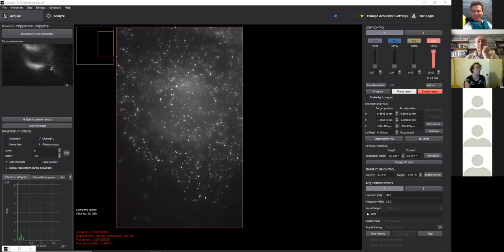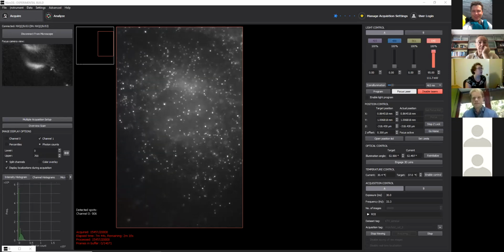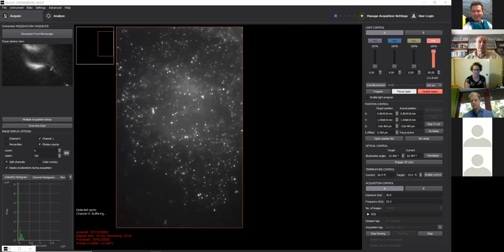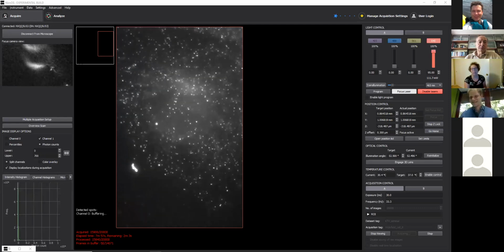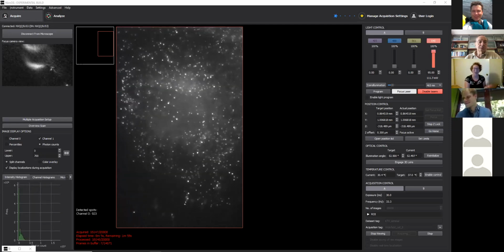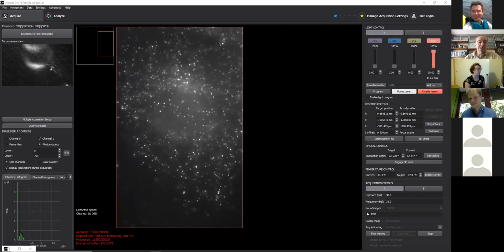Okay, cool. So basically, I'm gonna quickly run you through this and then tell you a little bit more about myself. So right now, what I've done is basically I've connected to a microscope in Oxford. It's actually, I think, next to Alex, or in the room next to him. I'm currently in San Diego, and so I'm operating this microscope remotely, which is pretty cool. Although it does require people in the lab in Oxford to put the sample on and put the buffer on and everything like that.